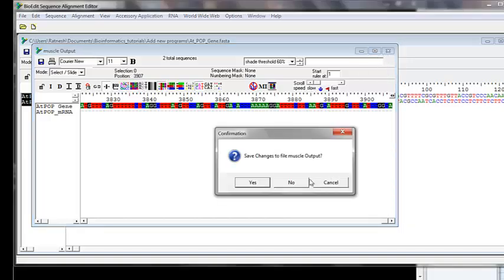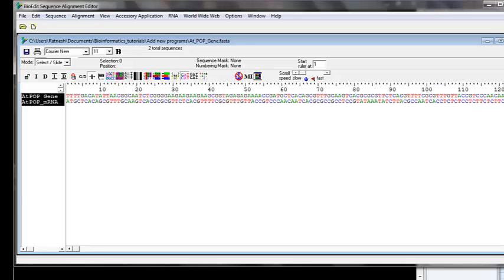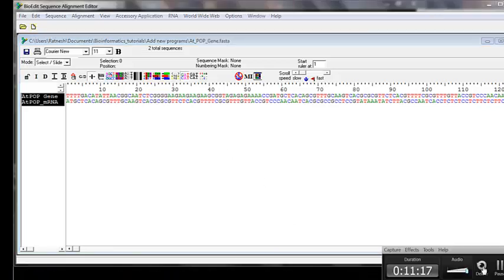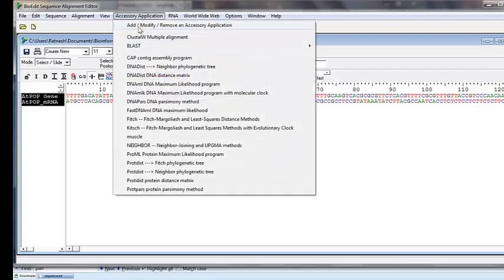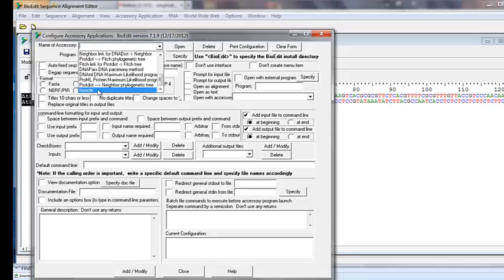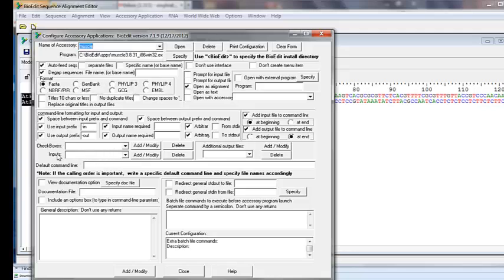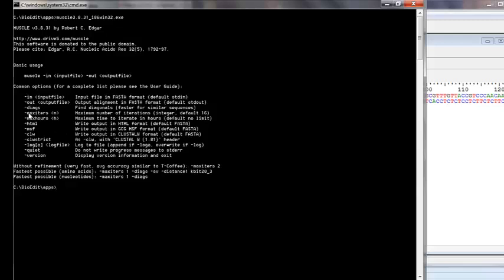That was how you add a third-party program into BioEdit. Now let's go back to the Add Program menu to look at the checkboxes for extra options. Go to Accessory Application > Add/Modify Program, select MUSCLE, and we'll add checkboxes. Looking at the MUSCLE command line options, we can add '-maxiters' for maximum iterations and '-diags' as optional parameters.